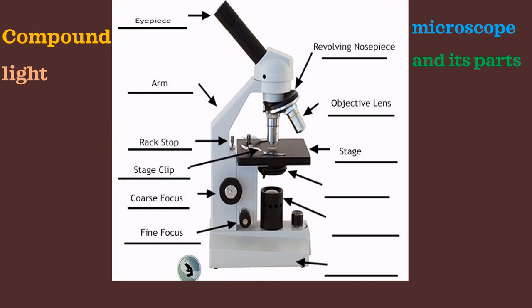The rack stop is an adjustment that determines how close the objective lens can get to the slide. The illuminator, also called the light source, provides light. The diaphragm adjusts the amount of light passing through the stage. The base is the bottom of the microscope and provides support. Now let's discuss the parts in a practical way.